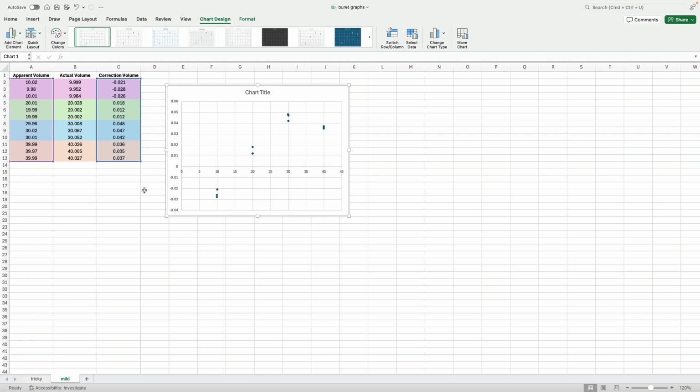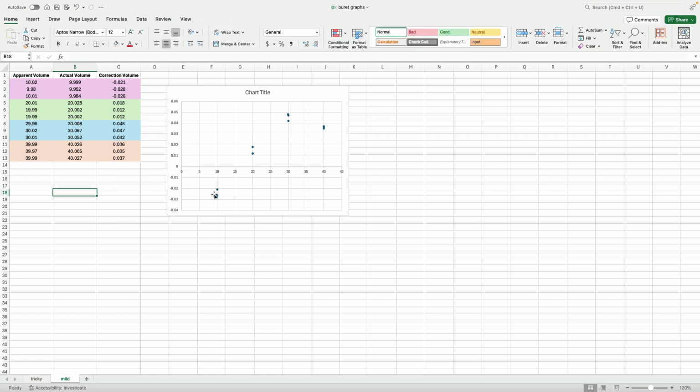So what we're going to do is trend lines. We want to do a trend line for this set, and we want to do a trend line for that set right there. So the first three sets of points are going to have their own trend line, and then this set right here, which is comprised of third and fourth, there will be another trend line there.